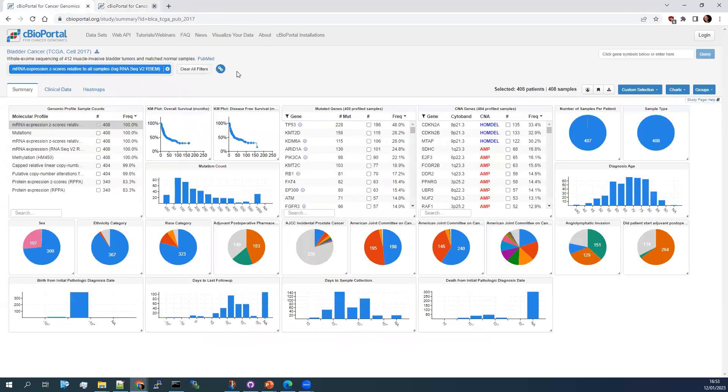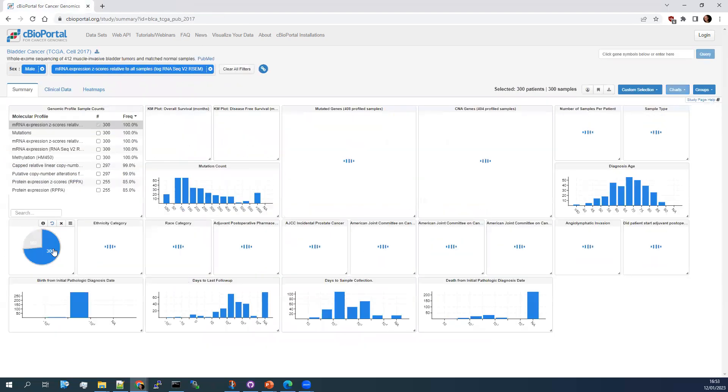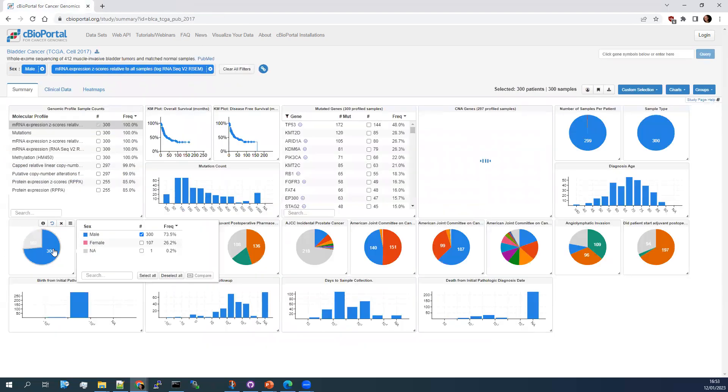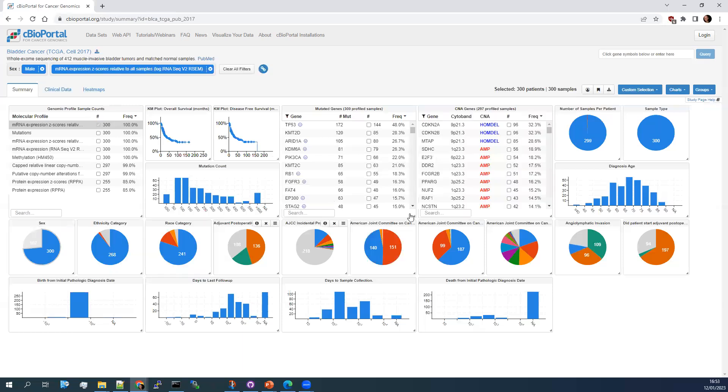So if we go back to the dashboard again, just like with the mutations before, if you were to click on, say, male and then it refilters everything, gives you different frequencies as before.